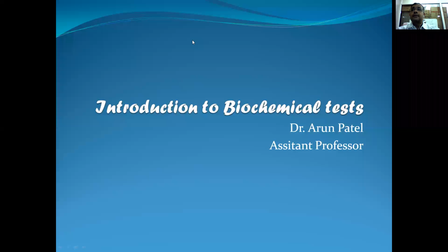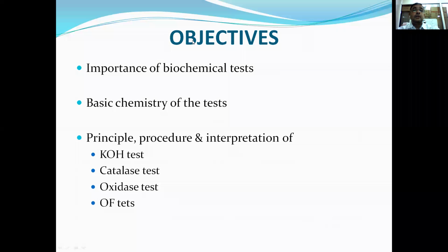Today we'll start with the next practical class, which is about the introduction of biochemical tests. In this class, first I will tell you about the importance of biochemical tests, particularly in microbiology.